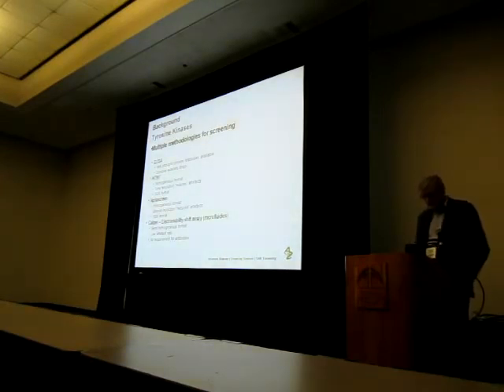Again, the big selling feature with these sorts of proximity type assays is that, of course, you've got time-resolved components in there, so you can get fewer artifacts. Well, in our hands, you still have artifacts. It's a homogeneous assay format, so there are going to be artifacts. You just have to accept that. The complexity of these assay formats, again, can actually amplify the number of artifacts that you're going to see as well.